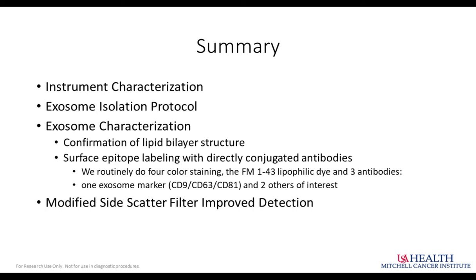And I think probably the last thing I'll say is that the new side scatter filter that we've come up with will be available in the near future. It takes a while at a big company to come up with a new product and part number and everything, but it's coming, and you will have access to that in the near future. Just one small simple filter to buy to swap out on your instrument.